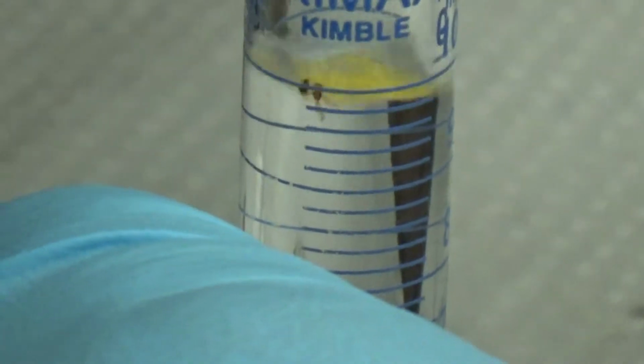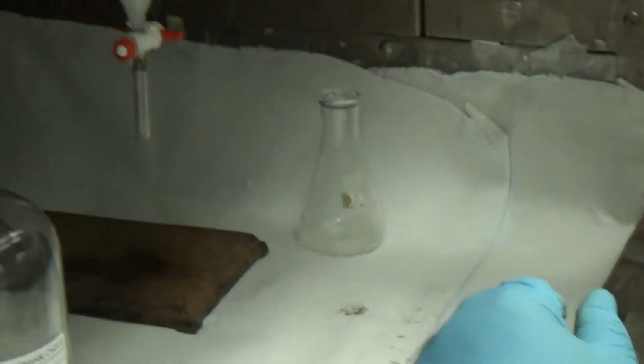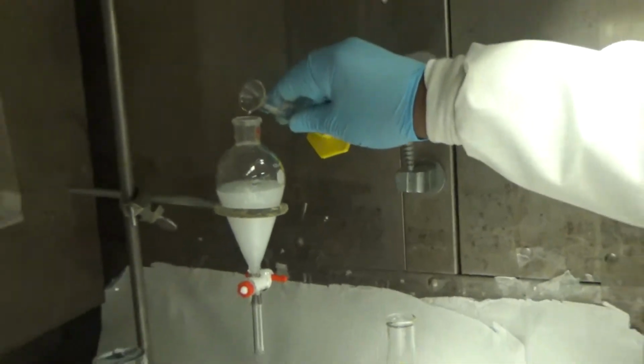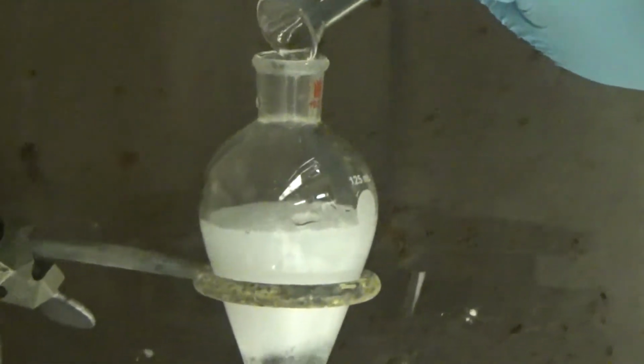Oh, I think there's a dead mosquito in there, but that's okay. I did not send him there. Okay, so we have a mosquito in the mix. But that'll be a contaminant of your product.